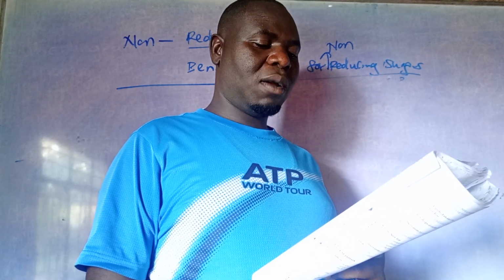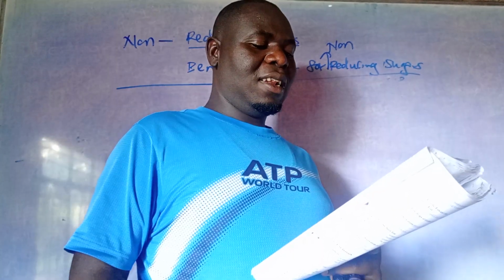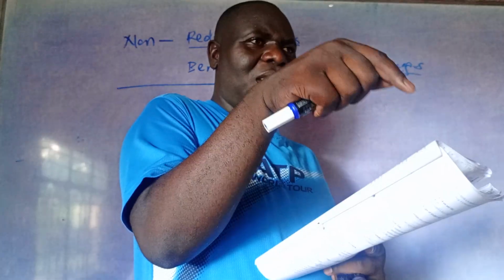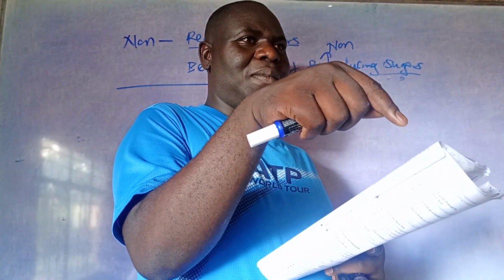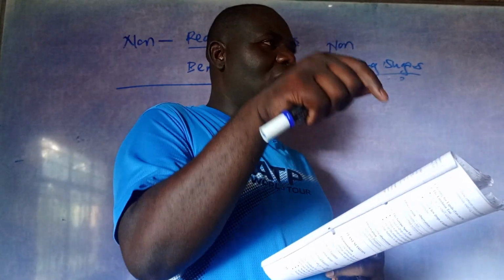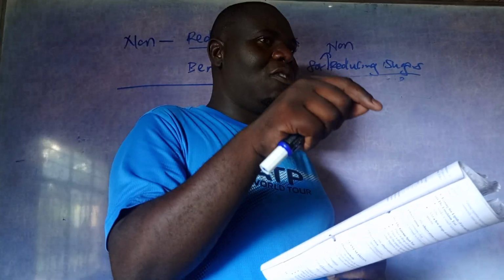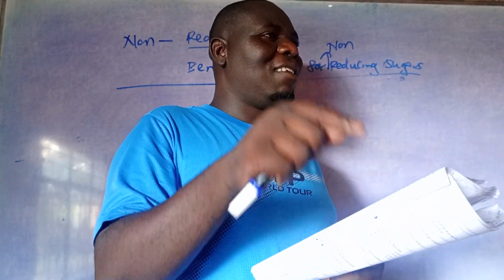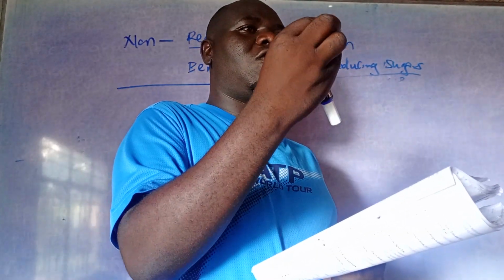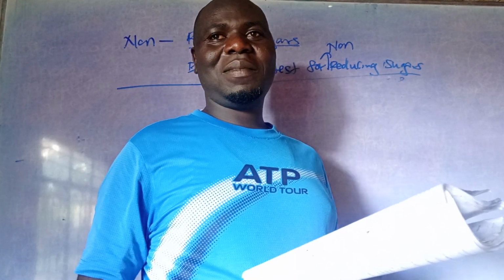Sodium hydrogen carbonate or sodium hydroxide solution is added to the mixture, little at a time, until fizz stops. Remember, there's acid there. Then now you start adding a base. Sodium hydroxide or sodium hydrogen carbonate is a base. It neutralizes acid. So when the fizzing occurs, it means the acid is being neutralized.